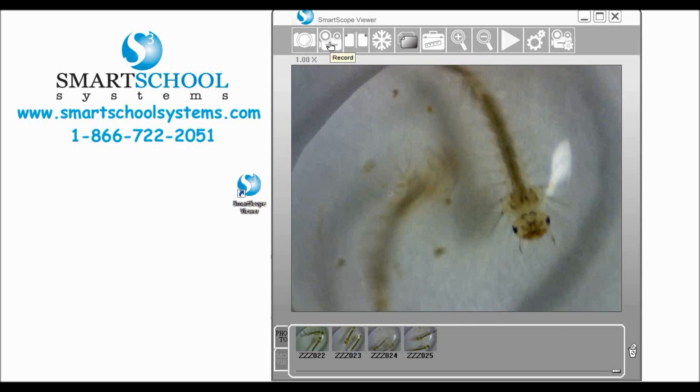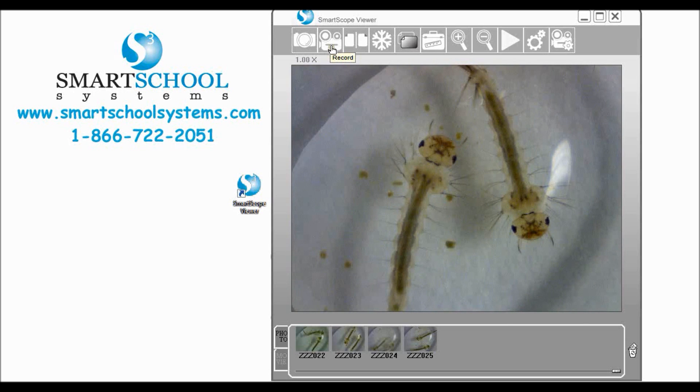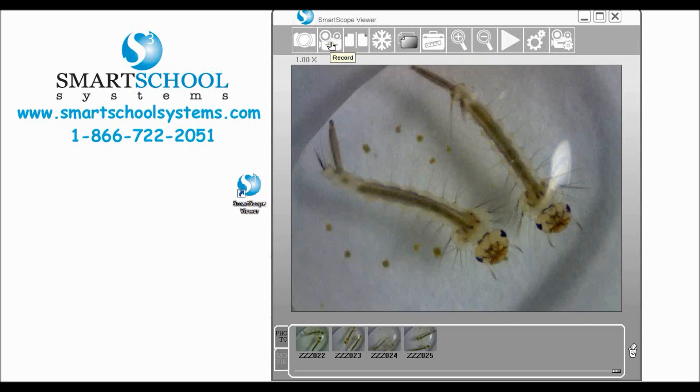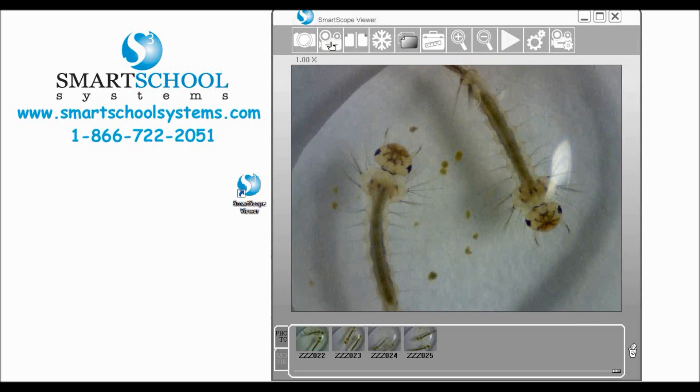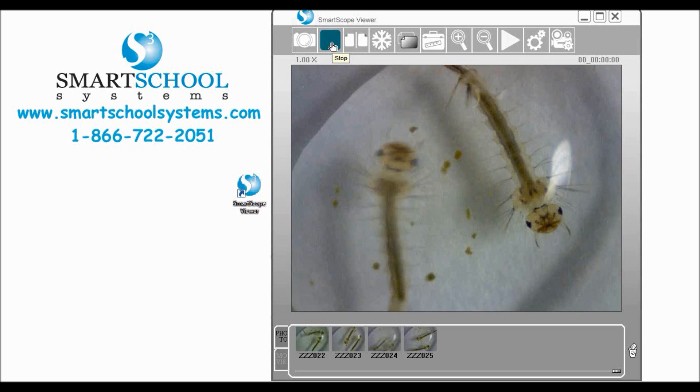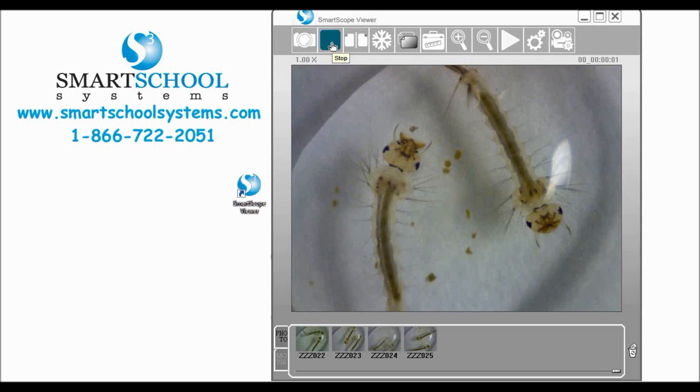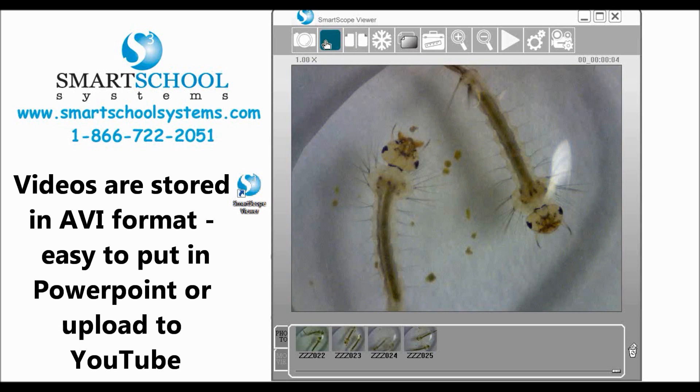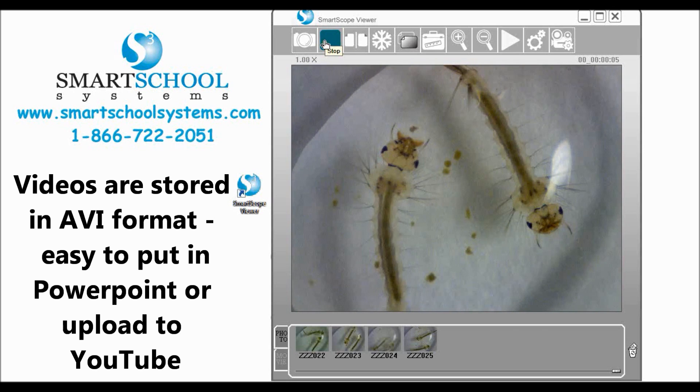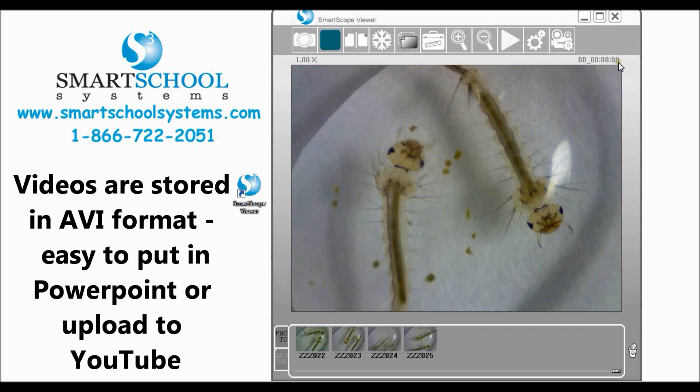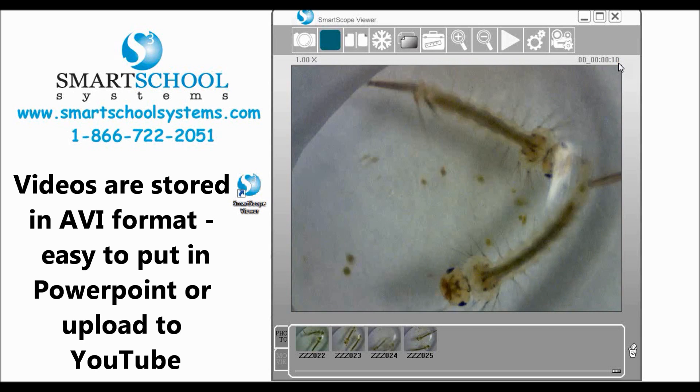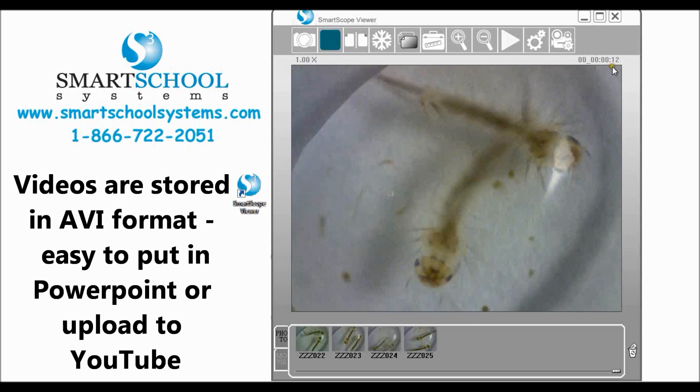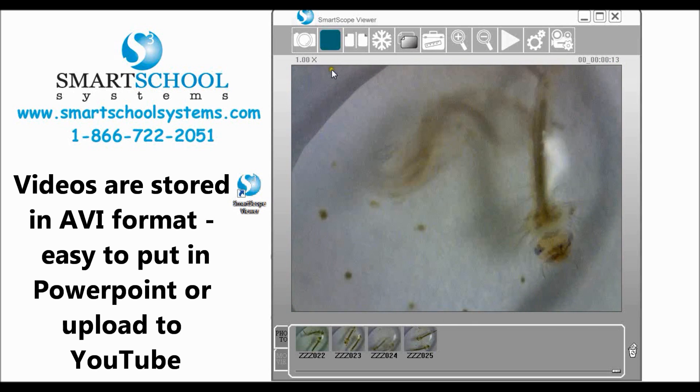Now the next icon over is the video camera icon and this is obviously for recording videos. If we click there we know that we're recording a video in two ways: you can see that our video camera icon became a stop button and we have a timer over here that is showing us the elapsed time of our video.